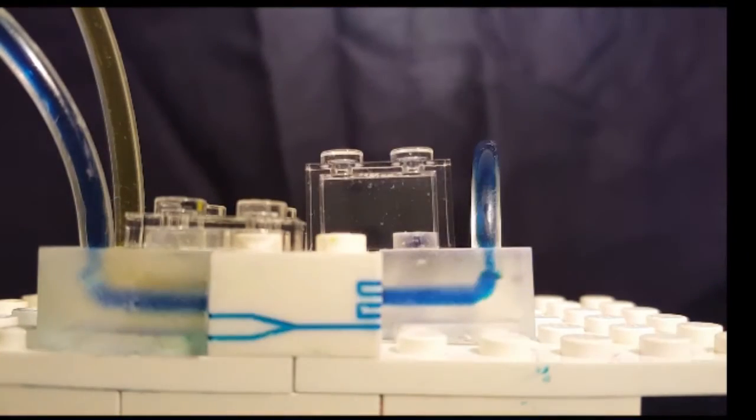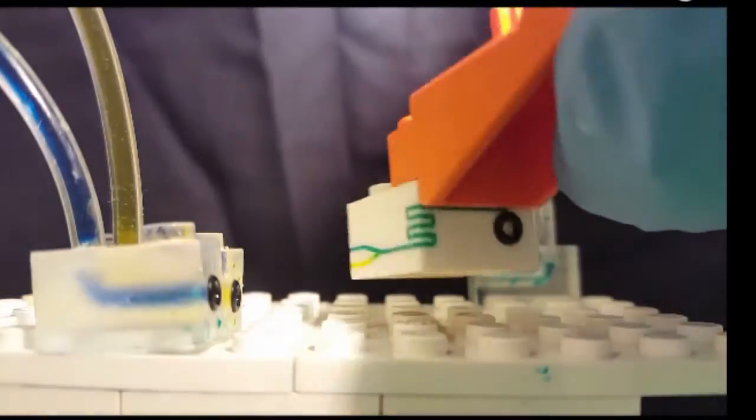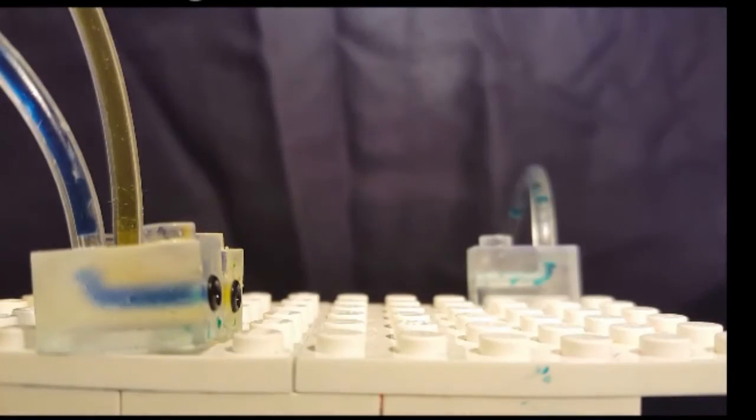Such devices typically take the form of flat, two-dimensional chips, edged with tiny channels and ports that are arranged to perform various operations, such as mixing, sorting, pumping and storing fluids as they flow.